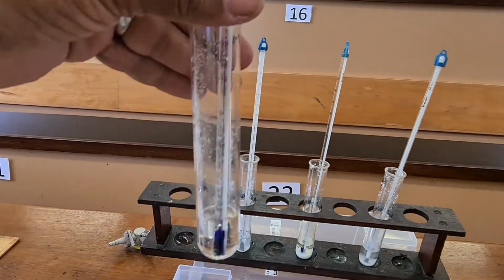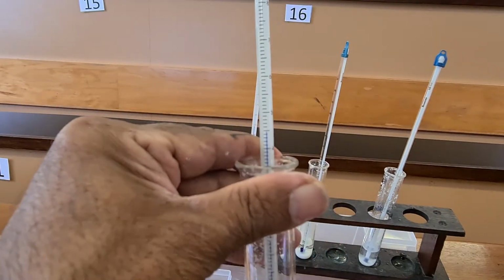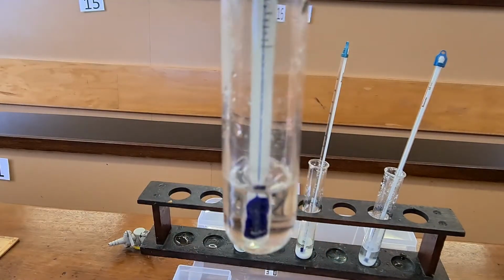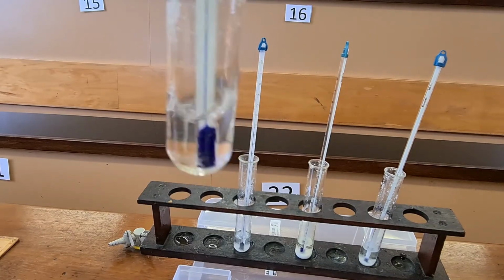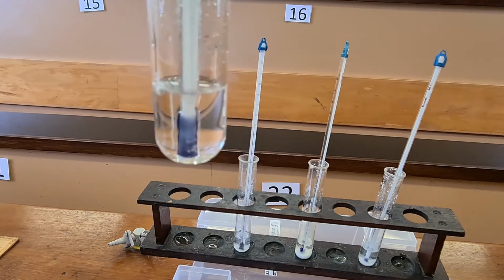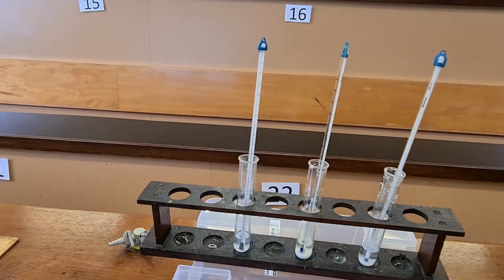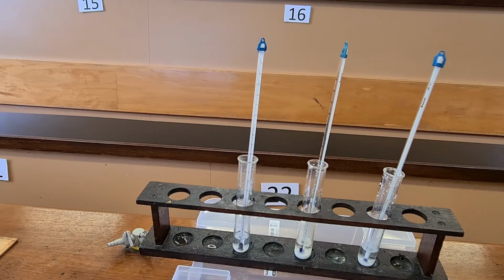And finally, A, the temperature there is 45-ish. No sign of crystals yet. And that might take a little bit of time for those crystals to form. I can cool it down with running water from a tap, which I am doing, which you can't see.